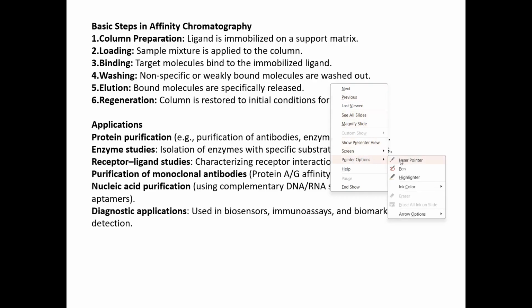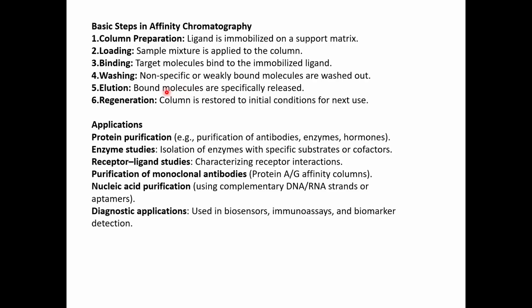Then you do your elution, where the bound molecules are specifically released, and then regenerate your column so that the column is restored and it is in the same condition as it was before, that is, free of any molecules or any particles bound to it, and it is now in a proper optimal condition for next use or for storage.